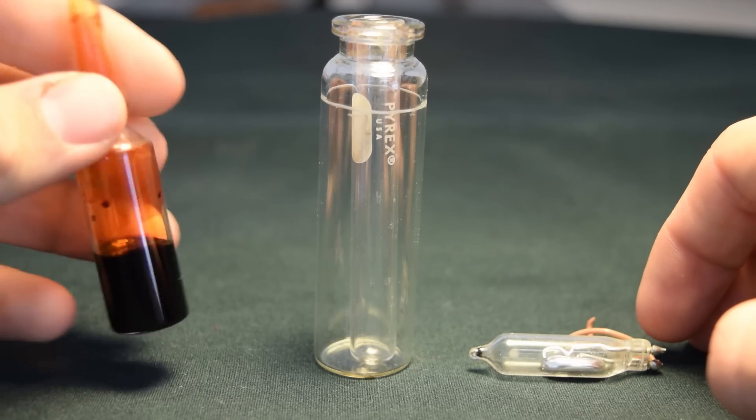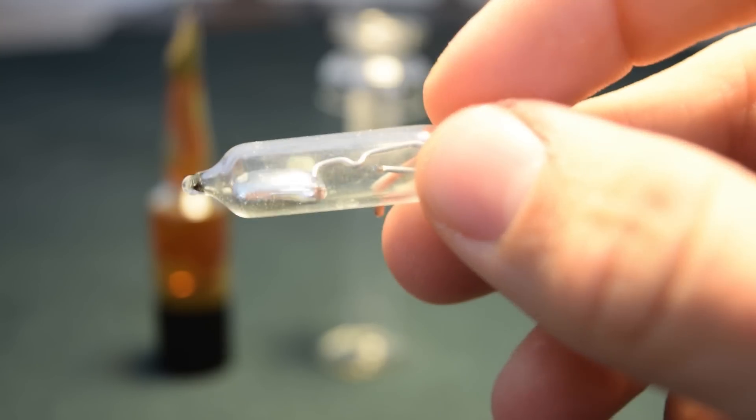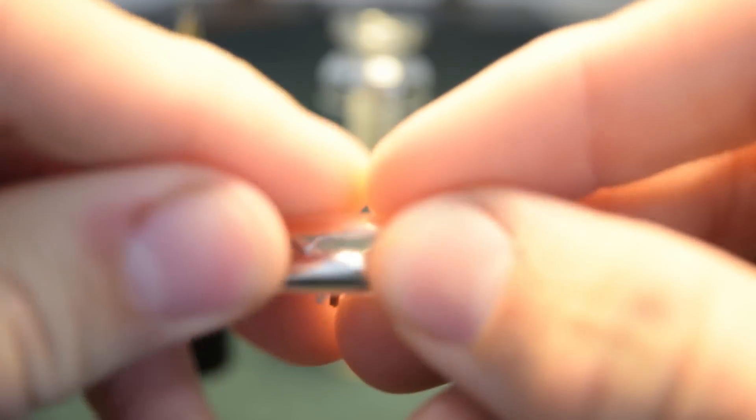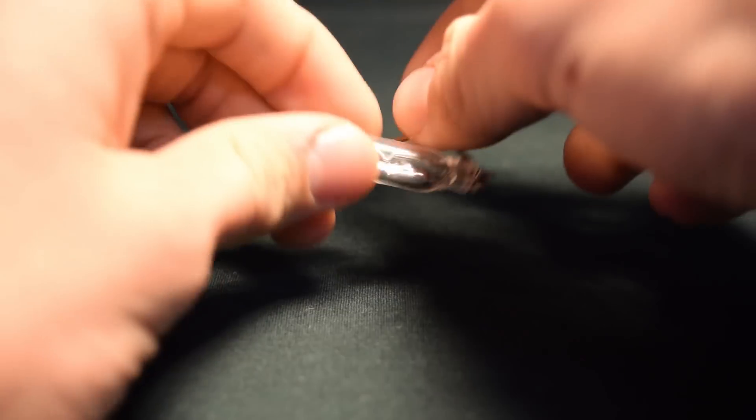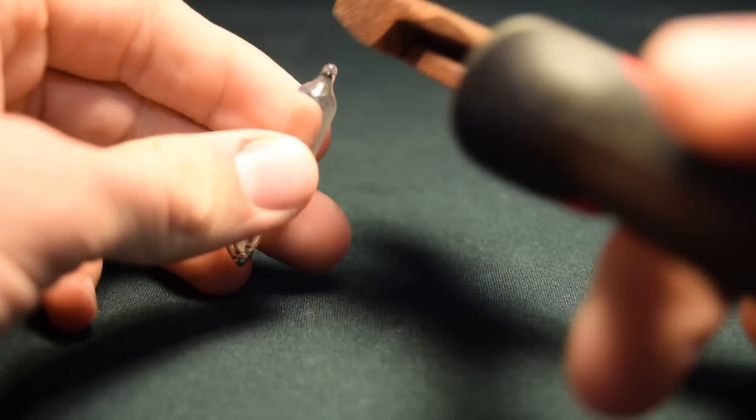These are my two favorite elements on the periodic table, and they're also both the only liquids at room temperature on the periodic table. This mercury came from a thermostat, the old type, that uses a mercury bulb.